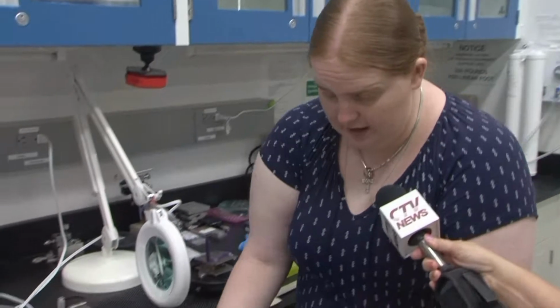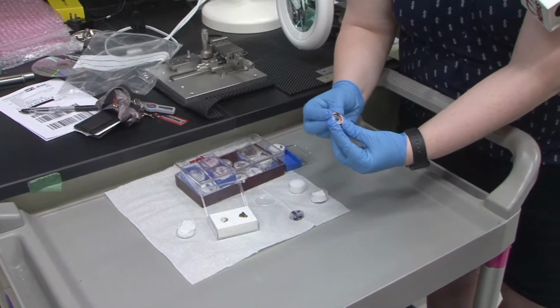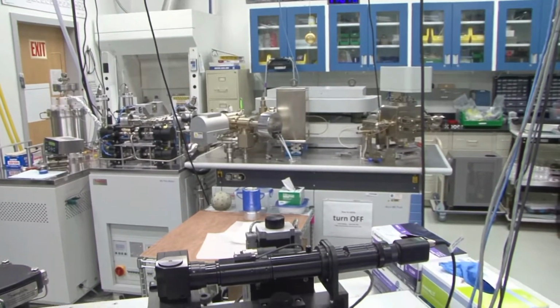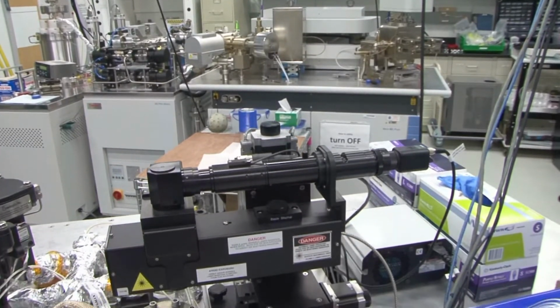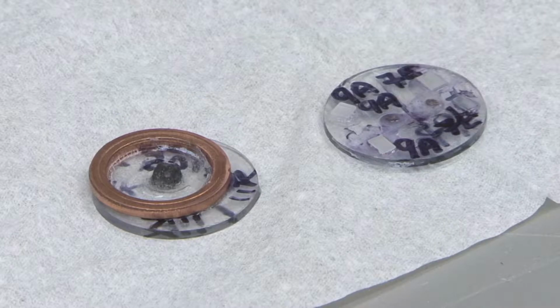We are looking at an Apollo 16 sample that we're currently working on in our lab. So we're looking at the age of the sample. Natalie Curran works in the Moon Girls Lab, an acronym for the Mid-Atlantic Noble Gas Research Lab. I take these little samples, and unfortunately, as precious as they are, I actually destroy them.